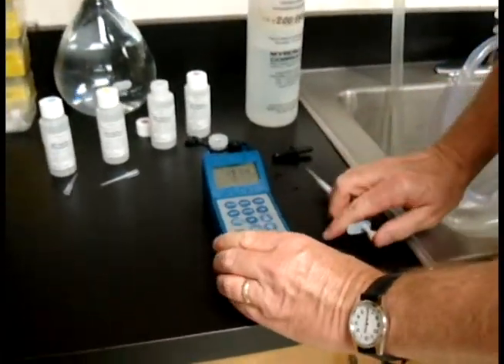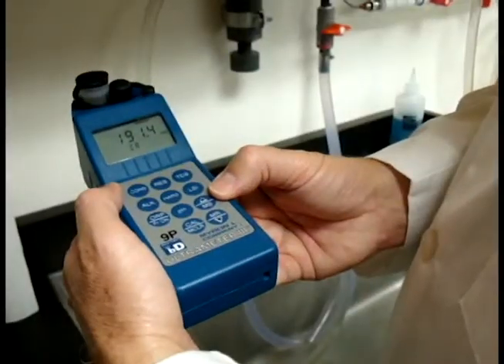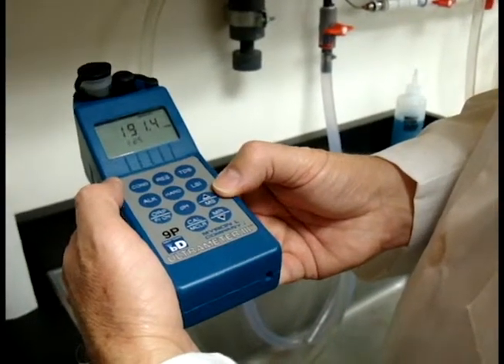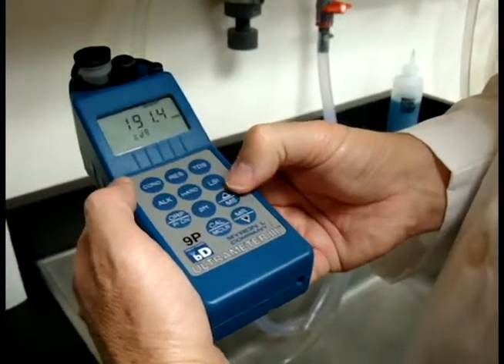There's our number. If doing an LSI reading later, you'll need to accept your hardness reading and put it into memory. To do that, you just hit the MS key right here.